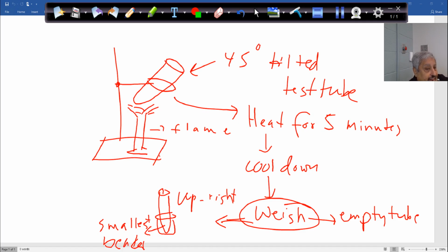Whenever you want to get it out, put your right hand, if you are right-handed, on the bottom of the test tube, and unclamp with the left, or vice versa. If you're left-handed, then you hold the bottom with the left, and then unclamp with the right hand. Okay, guys? Never touch the whole thing, because all this step will be gone. It's no use.